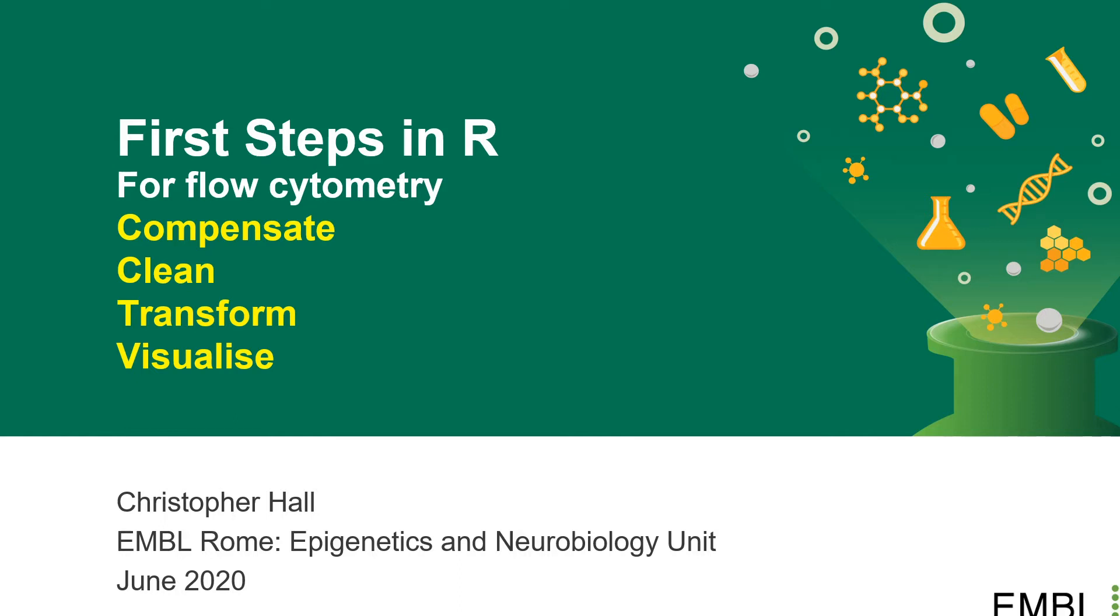Hello and welcome to the second video in my series of very short tutorials about how to analyze your flow cytometry data in R. The second video will cover compensation, cleaning, transformation and a little bit of data visualization.